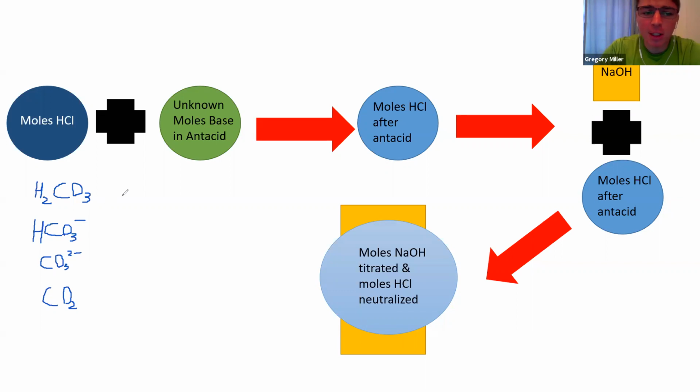The carbonate buffer system is actually also important in the human body. That's what your blood and a lot of systems in your body use to help buffer and resist changes in pH. So again, look into that if you want some context for why this matters. I'll go through this in the experiment video, but I have to boil out all of these samples to get rid of this buffer system. Otherwise, I'll end up adding way more NaOH than I need, and all of the calculations will be off.